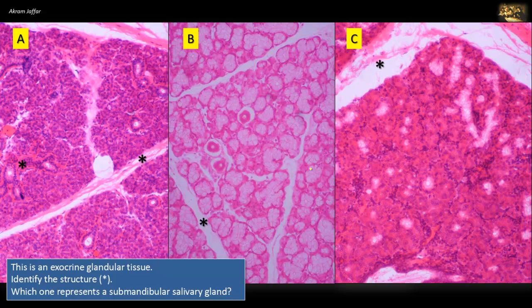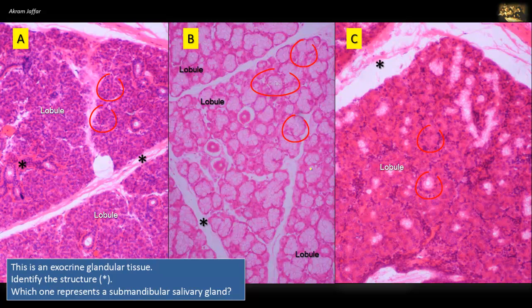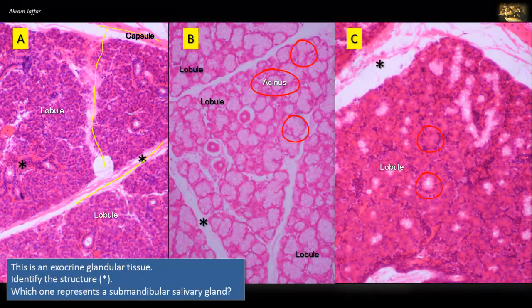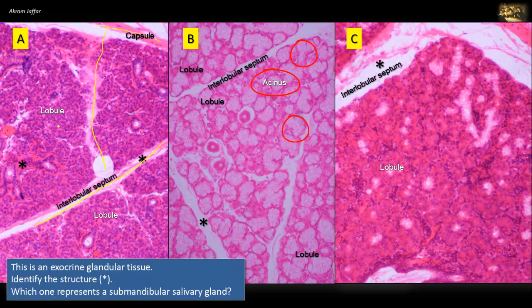This is an exocrine glandular tissue. Identify the structures indicated by the asterisk in the three sections, and which one of these three sections represents a submandibular salivary gland. The three sections show the general architecture of the major salivary glands — exocrine glands. Each is divided into lobules, and the lobules contain many secretory units, the acini. The connective tissue septa, represented by the asterisks, are located between the lobules and extend from an outer fibrous capsule, conveying blood vessels and ducts.